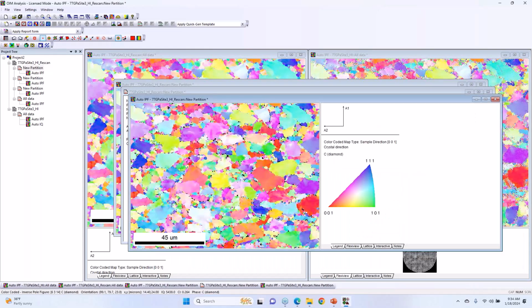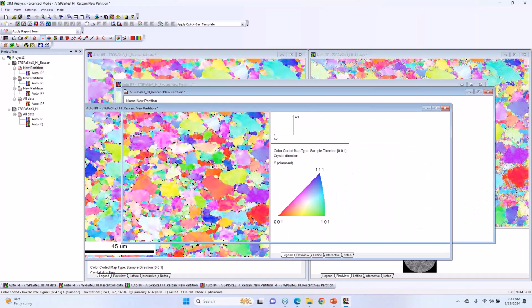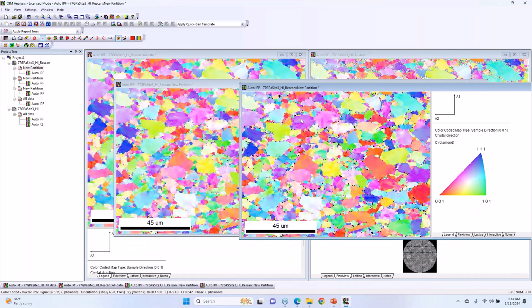But for me, when I look at these two, trying to say what's the difference, you can go in and ask, is 5 the right setting here? Does it look like the microstructure that would make sense for that sort of material? This is all the material, and I think in the end we said, yeah, this is pretty representative of what's expected for it.